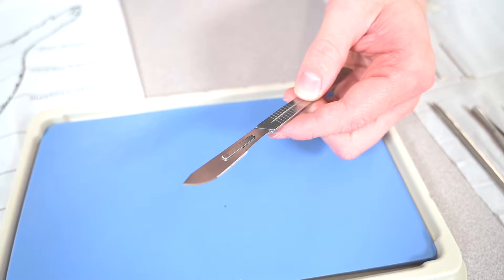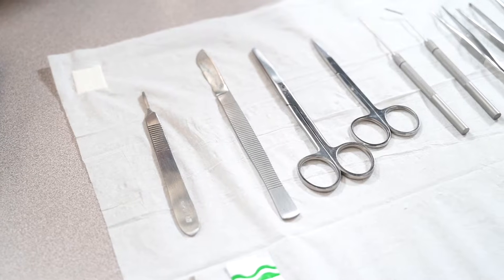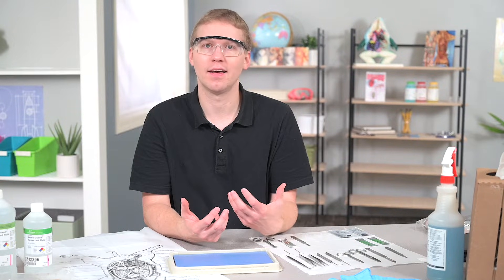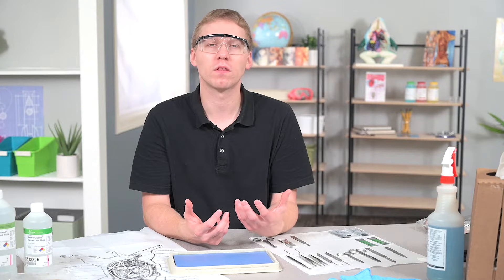I have two different types of scalpels: a scalpel with a removable blade and a scalpel that is one entire piece. One of the most common questions we receive is about the removable scalpel — how do you safely add and or remove a blade? To do this, you need a tool with a good grip, ideally hemostatic forceps because they can lock onto the blade, but forceps or pliers work too.